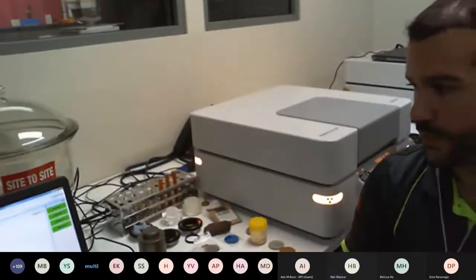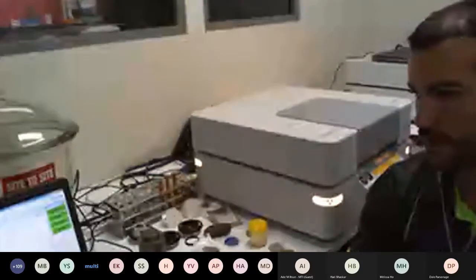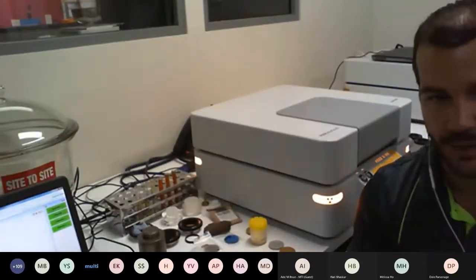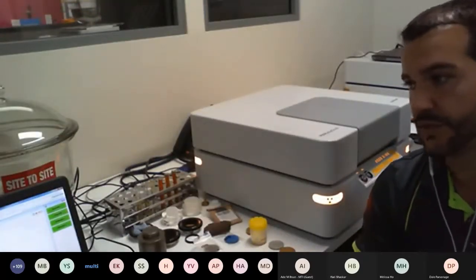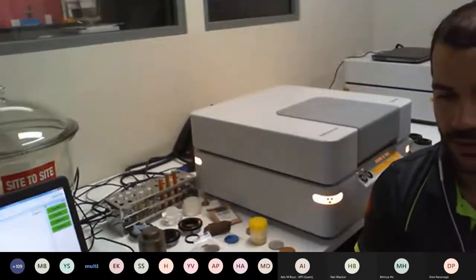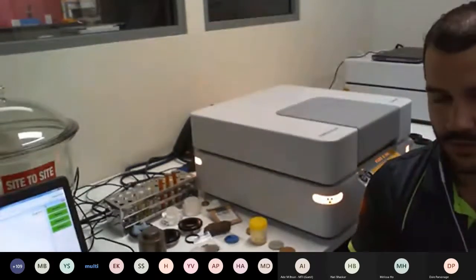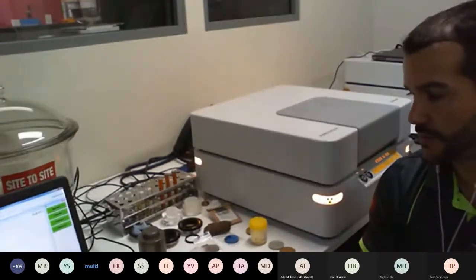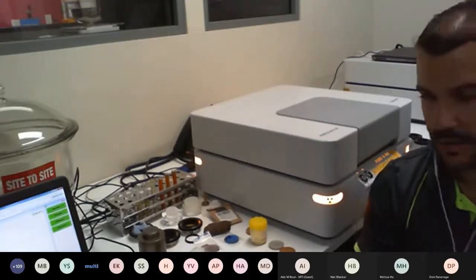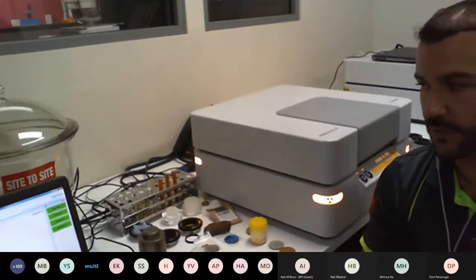Another great feature with the Epsilon software is an automatic program selection. So we mentioned how the saprolite and limonite have to have separate applications to run in order to get the best results. You can introduce a third program, which is an automatic selection program. And with these materials that are quite different, you could have it look at only iron and magnesium and essentially run for a very short period of time.